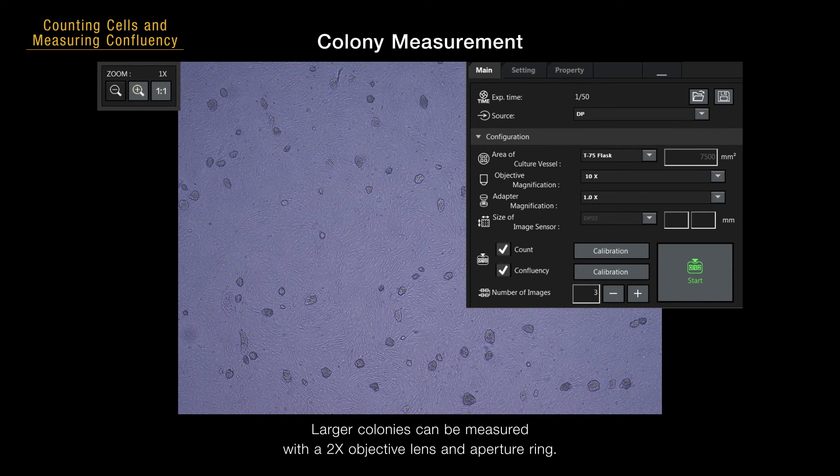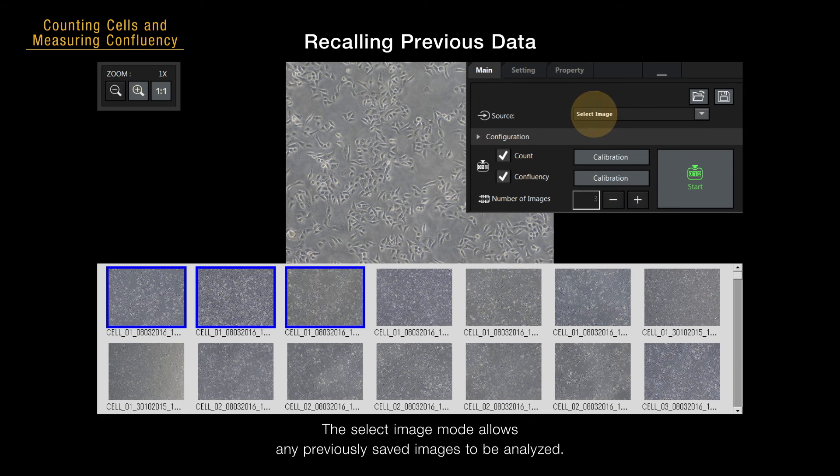Larger colonies can be measured with a 2x objective lens and aperture ring. The select image mode allows any previously saved images to be analyzed.